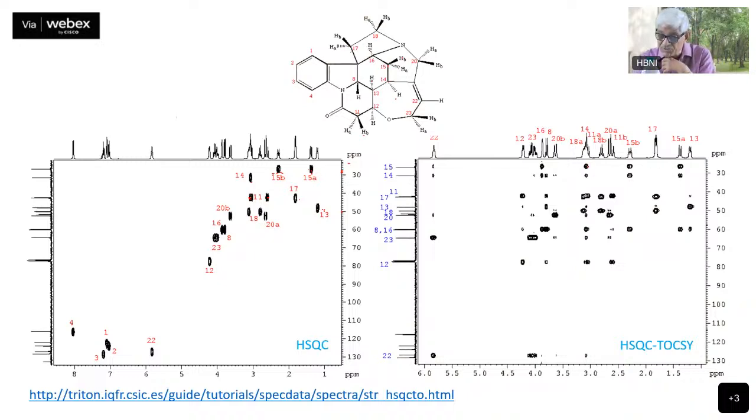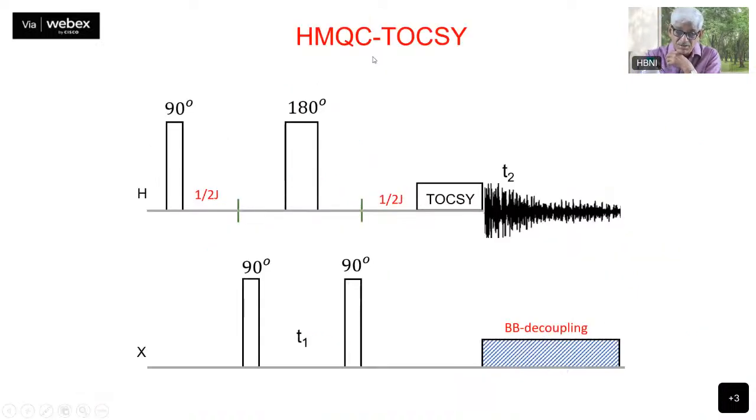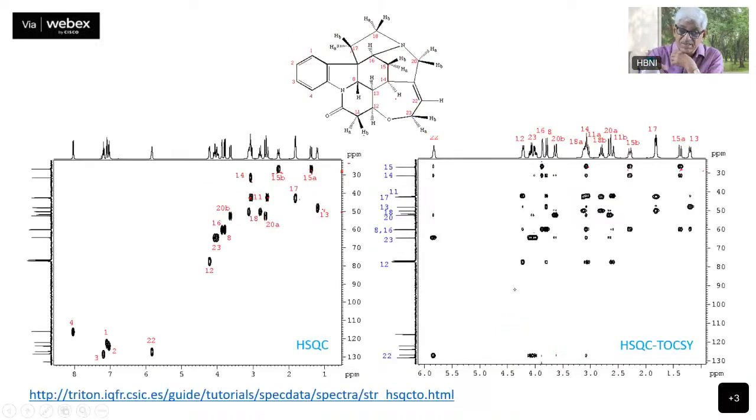It should go, there is a 14 here. So from the 15, these are 15A, 15B, carbon 15 is here, 15A, 15B, and the relay through the proton coupling network to 14 here, and also to 16. Where is 16? The 16 is here. Oops. 16 is here. So therefore, it's a relay. There is a relay of magnetization, right, through the proton coupling network. So you also see to the 16 there. So similarly, one can analyze the various things.